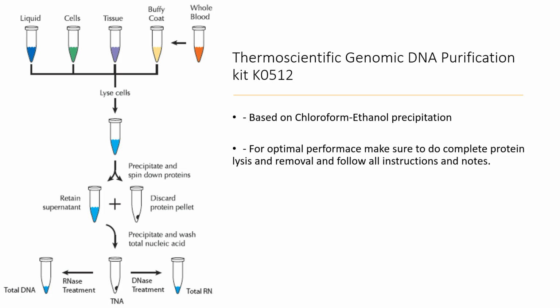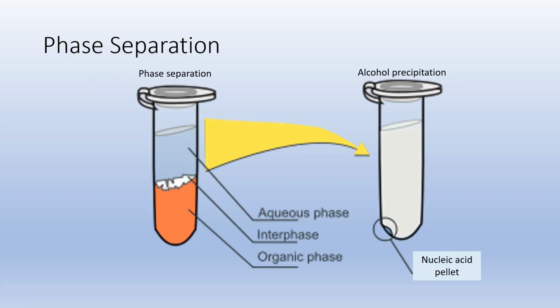However, in many cases, RNA is extremely fragile, so it does get degraded simply through the process unless it's extracted in a very careful manner using agents that protect it from degradation.